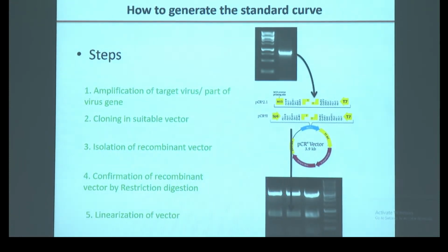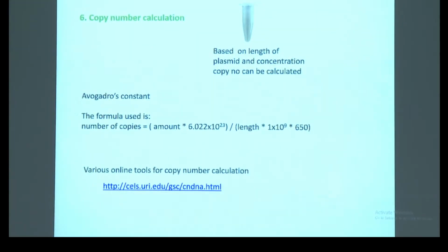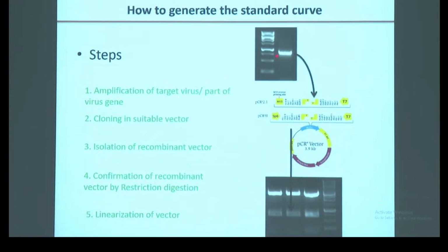तो यहाँ पे पूरा प्लाज्मिड होगा, प्योर प्लाज्मिड, वो भी एक PCR प्रोडक्ट का, एक सिंगल DNA स्ट्रैंड का, रिकॉम्बिनेंट प्लाज्मिड के साथ में. ओके, क्लियर अप टू दिस? So अभी मेरे पास एक ट्यूब है जिसके अंदर मेरा एक recombinant plasmid है. उसको मैंने linearize कर दिया है by cutting it using a restriction enzyme from a single site. Now I go for a spectrophotometer or nanodrop based reading. Last time I told this is the 771 base pair long PCR product, and this is 3.9 kb my plasmid.